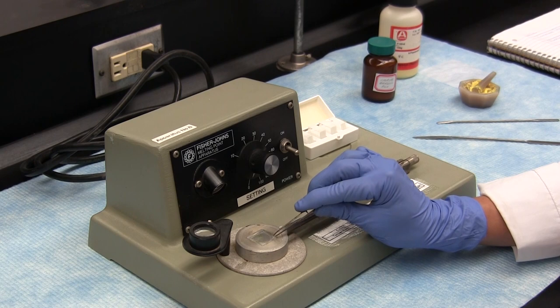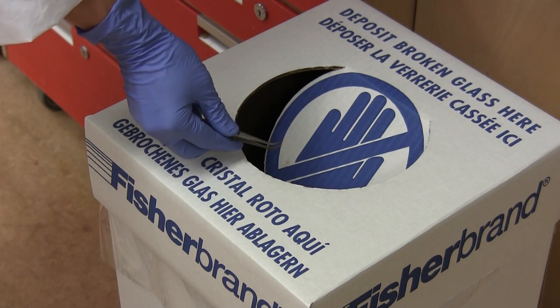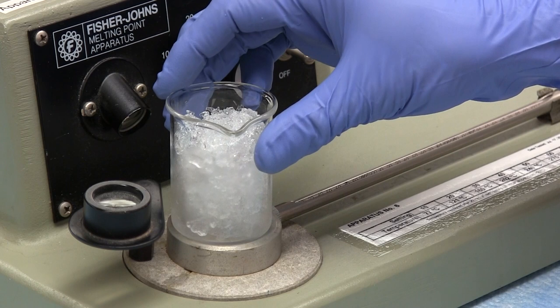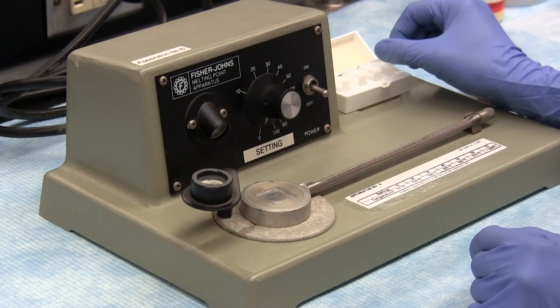Used cover glasses should be disposed of in the waste glass container. If you need to do another melting point determination straight away, the stage can be quickly cooled down by placing a small beaker with crushed ice on top. Usually, the stage need not be cooled down to room temperature, just about 20-30 degrees below the expected melting point.